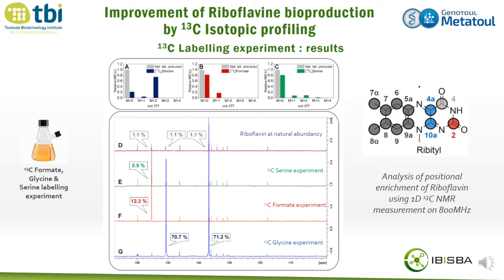Our collaborator in Germany performed cultivation on C13 glycine, C13 serine, and C13 formate separately, and thanks to C13 NMR, we were able to measure the positional C13 enrichment for the carbon 2, the carbon 4 alpha, and the carbon 10 alpha. And we can notice here that the three compounds contribute to the construction of the carbon skeleton of riboflavin: formate and serine for the C2, and glycine for the C4 alpha and the C10 alpha.